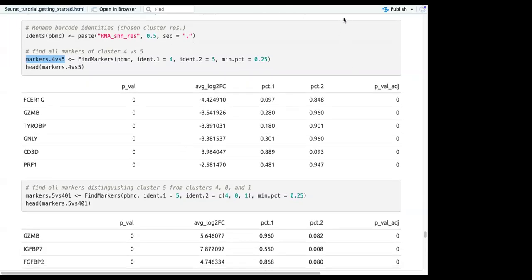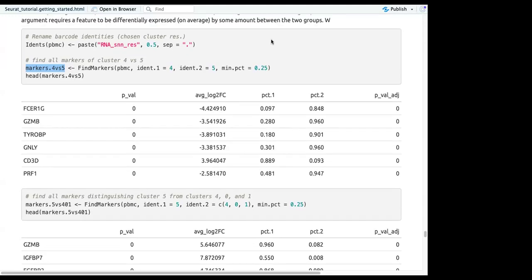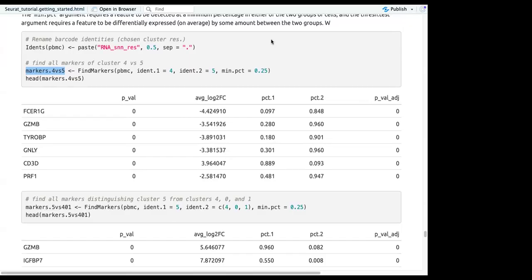I have a question too, real quick. This is basically showing clusters of the same samples, right? What I mean is, let's say you have one tissue that you're looking at and you're comparing endothelial cells to CD4 cells. Can you also apply the same method if you have two independent samples, like treated versus non-treated? And if you were able to identify clusters, can you then mix and match?